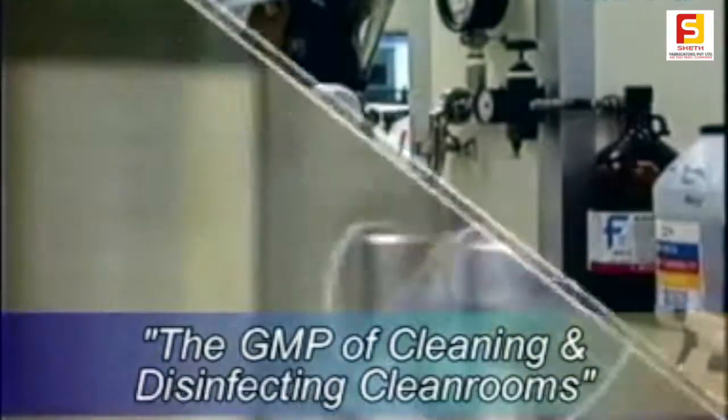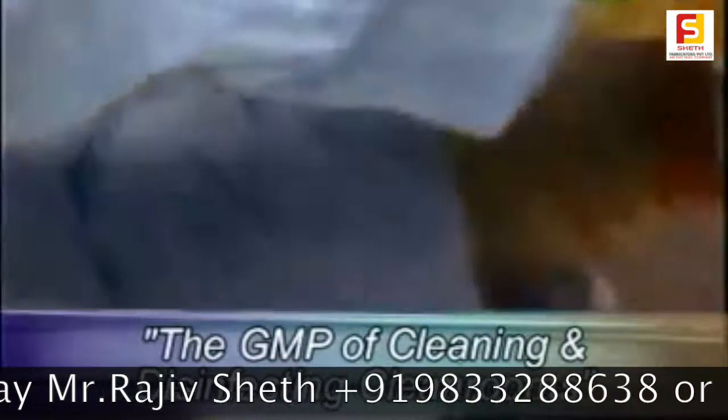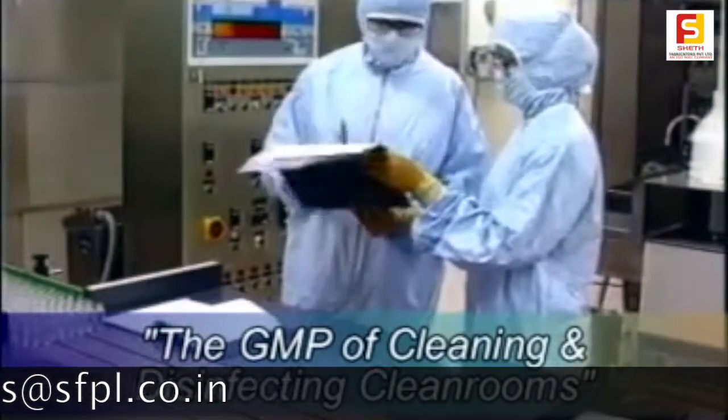In a prescribed period, usually about 24 hours, the cleanroom must be cleaned again to remove residual fogging solution. The final step is to document what was done in the cleaning log for the supervisor to sign off.